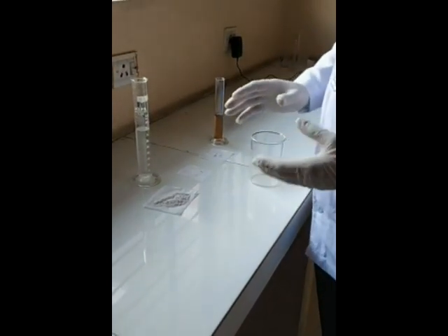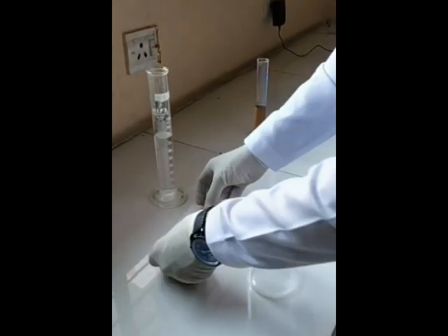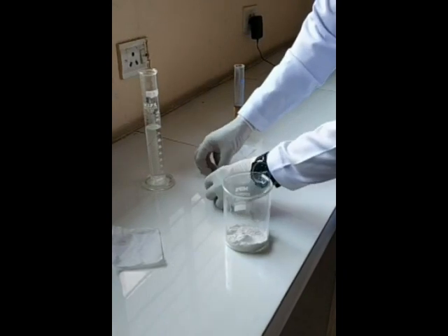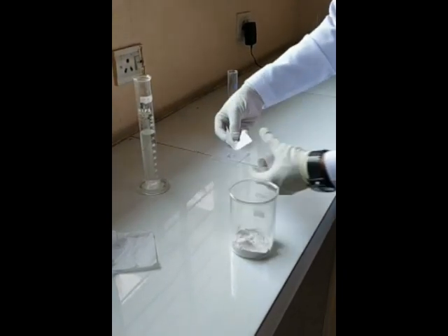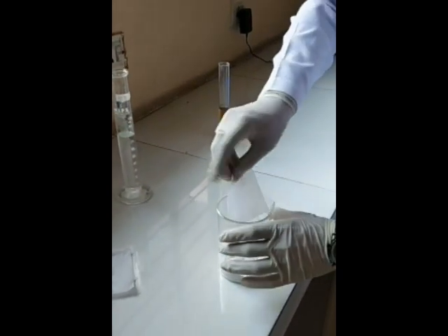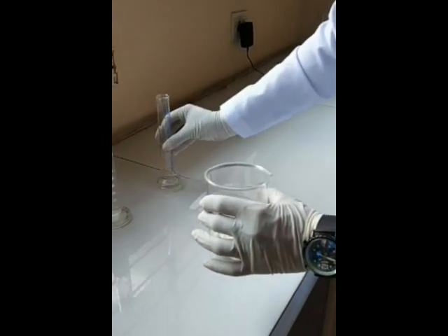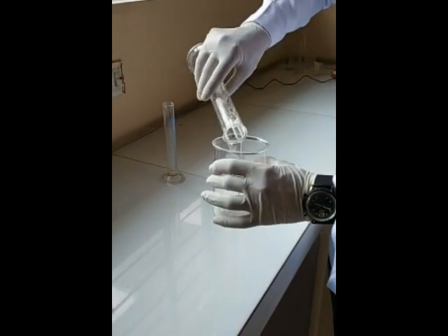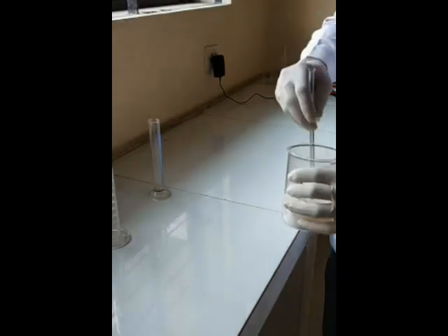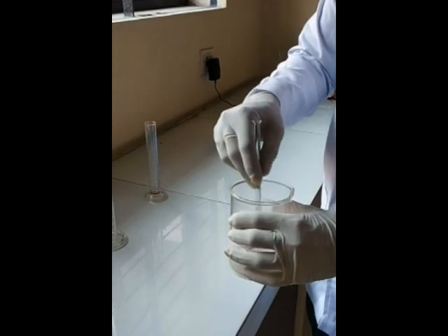Next step: preparation of a solution containing the acid phosphates of calcium, potassium, and sodium. For that, we mix calcium carbonate, potassium bicarbonate, sodium phosphate, and the remaining phosphoric acid with 80 ml of purified water using a glass rod until a slurry is formed.